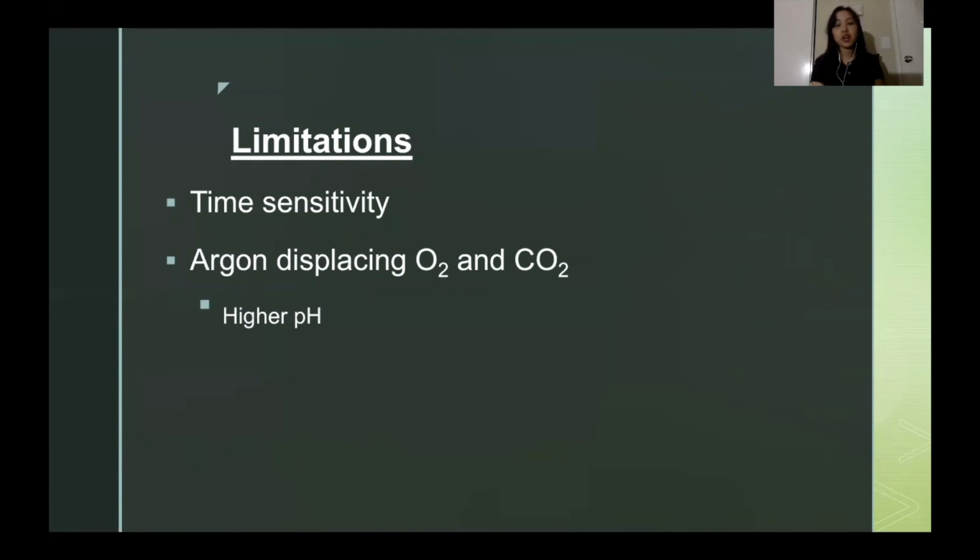So the measurement process for this experiment was very time sensitive, which is an important limitation to this project. The first HPLC run of every new sample was always the one with the highest amount of catechin, and repeated runs of the same sample showed that EGC and EGCG were the most unstable of all the catechins. And instability of EGC and EGCG therefore indeed explains the large standard deviations.